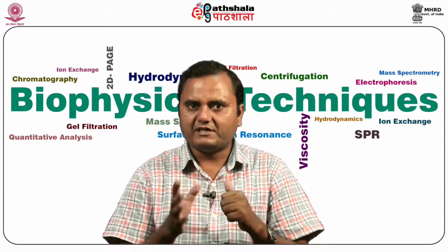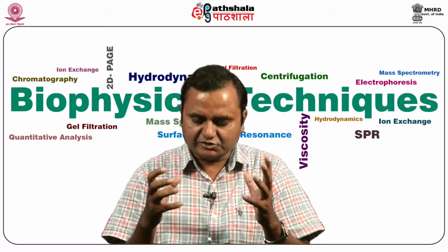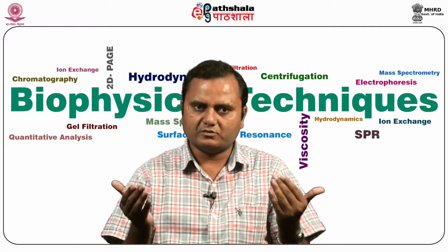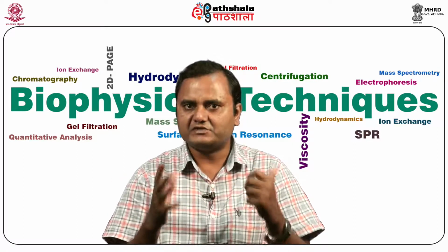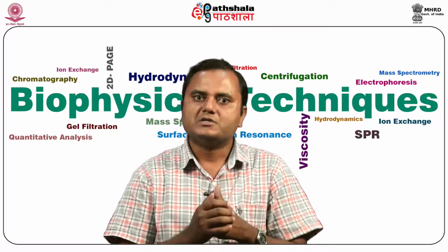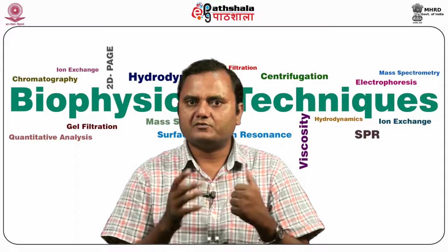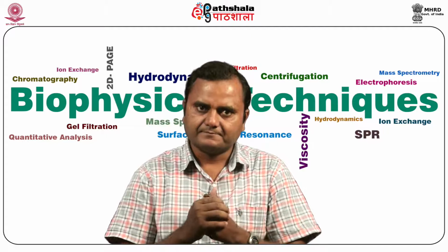One very important thing with this ultracentrifuge is the application of the vacuum system, because it runs in a chamber where the pressure is 0, meaning it is a vacuum. If there is pressure, then the air creates frictional force, and the frictional force is so high that the chamber can burn out. So to avoid such friction, the chamber should be vacuumed, so there are no frictional forces and the centrifugation can be done very easily.